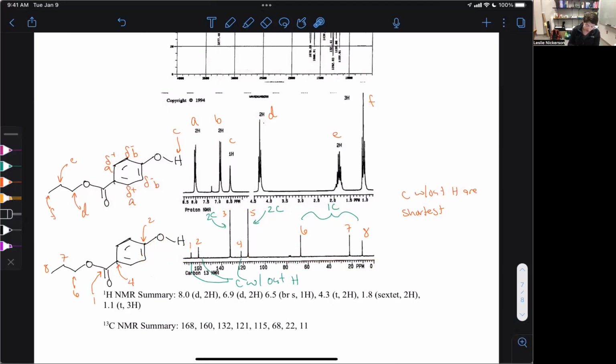We kind of already talked about the delta plus, delta minus for those 2 situations where we've got 2 equivalent carbons in each case. So we're going to use the same idea where these are going to be delta plus, so those are going to be our more deshielded ones for 3. And then our more upfield ones at 5. And so that's how I would assign it.